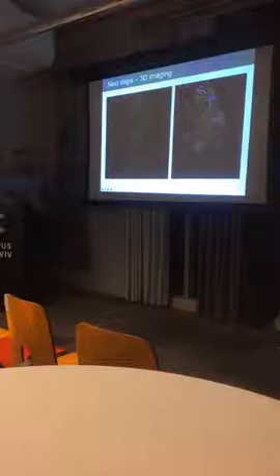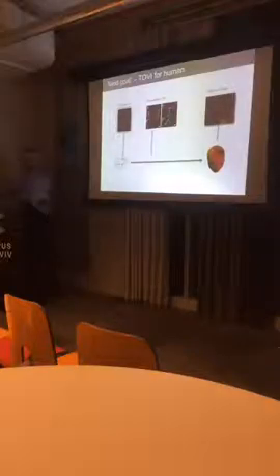Okay, these are blood vessels, which is 3D when we collect with different perspectives. Okay, I showed you some animal applications, and of course our next goal will be to think about how we can apply it on a human, and it's still challenging.